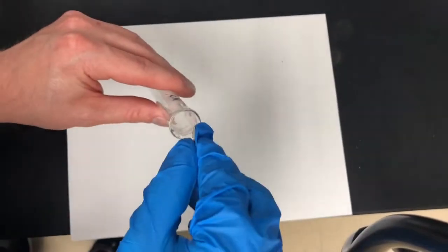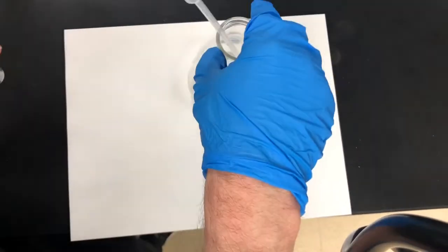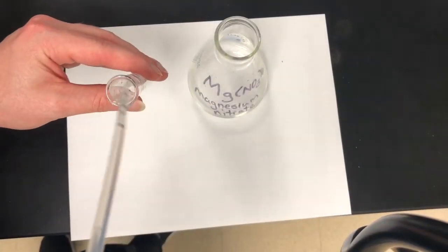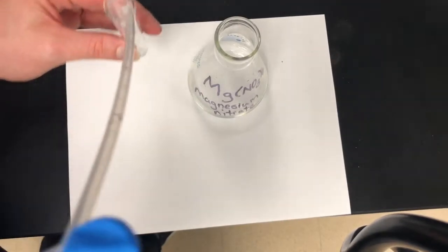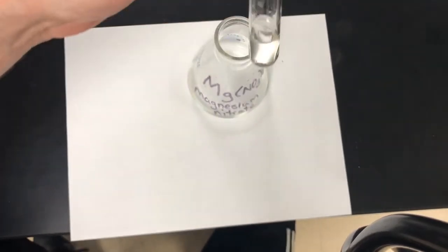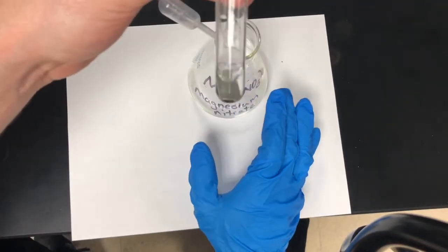Okay, so I'm going to take another piece of zinc and I'm going to put it in my test tube. And we're taking magnesium nitrate. So magnesium nitrate is a clear solution, looks like that. And I'm going to put some squirts in my test tube and see if anything happens. Okay. So as you can tell, nothing happened by the reaction of magnesium nitrate and zinc. So our prediction was true.